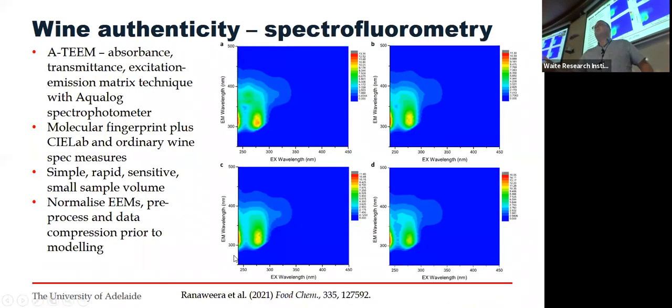Well, there are different ones. Richira, my PhD student, looked at a range of different methods, and we were thinking about rapid ones that could be deployable within the supply chain. That means basically spectroscopy. And if you do spectroscopy, then you need to do black box stuff with it, a little bit like what Nina talked about last week.